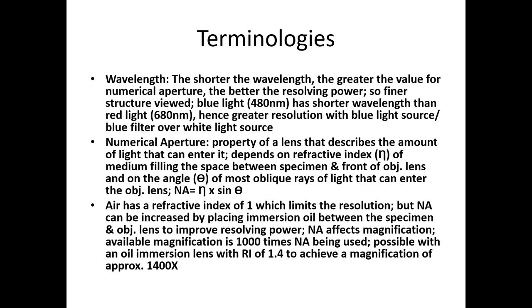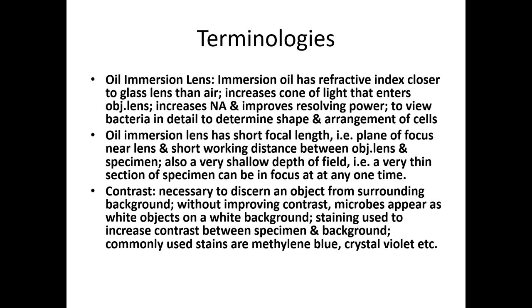All those things we had discussed in the last class, regarding the refractive index of air versus the refractive index of immersion oil. Why we use immersion oil, what the function of immersion oil is, and how it improves the numerical aperture and thereby improves the resolving power. And also the term contrast.